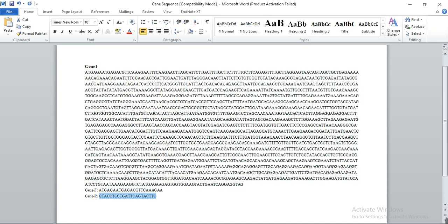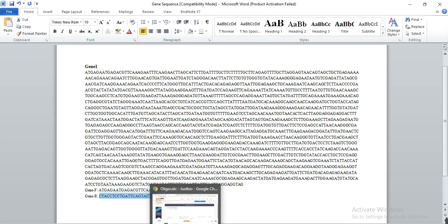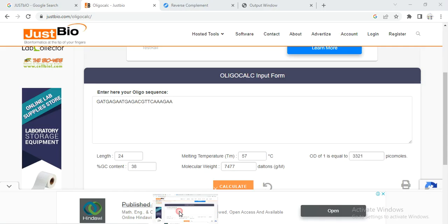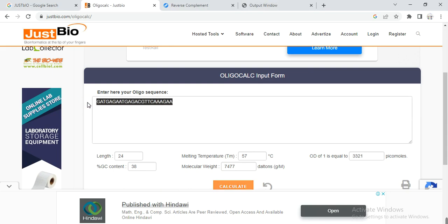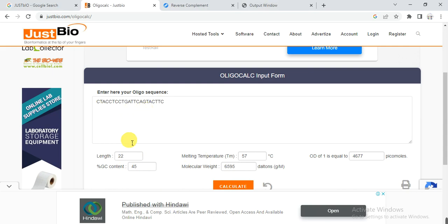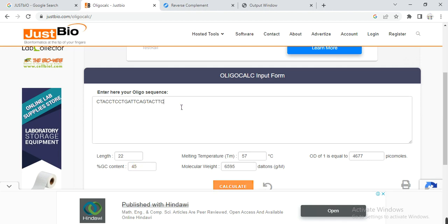Then copy the reverse primer, then paste and click on calculate. So you will see the calculation of the reverse primer. Its melting point is 57 and it contains 45% GC. So this reverse primer is very good and you can also edit by adding some other base pairs or deleting some base pairs. Like here if I delete this and then calculate, so its temperature decreases.